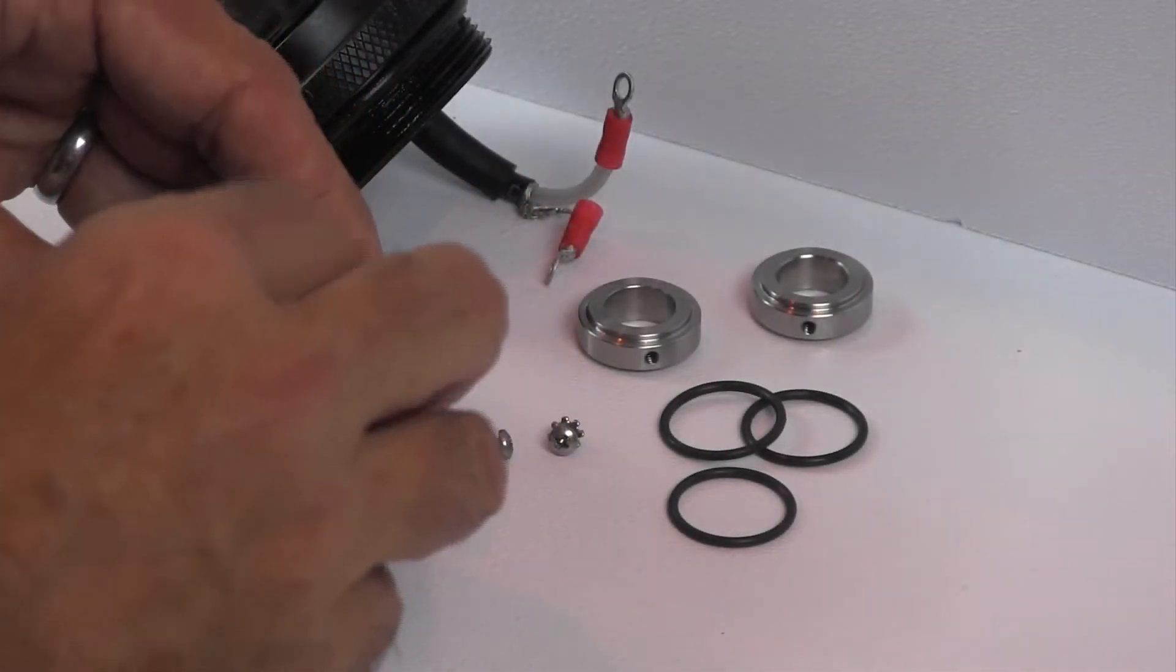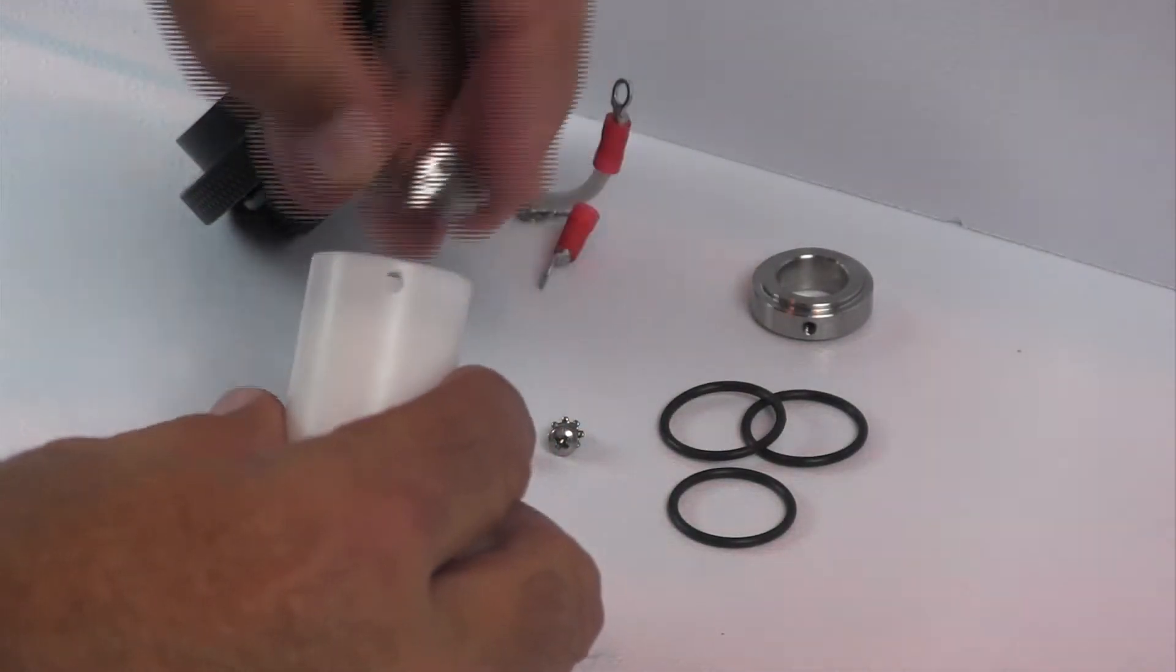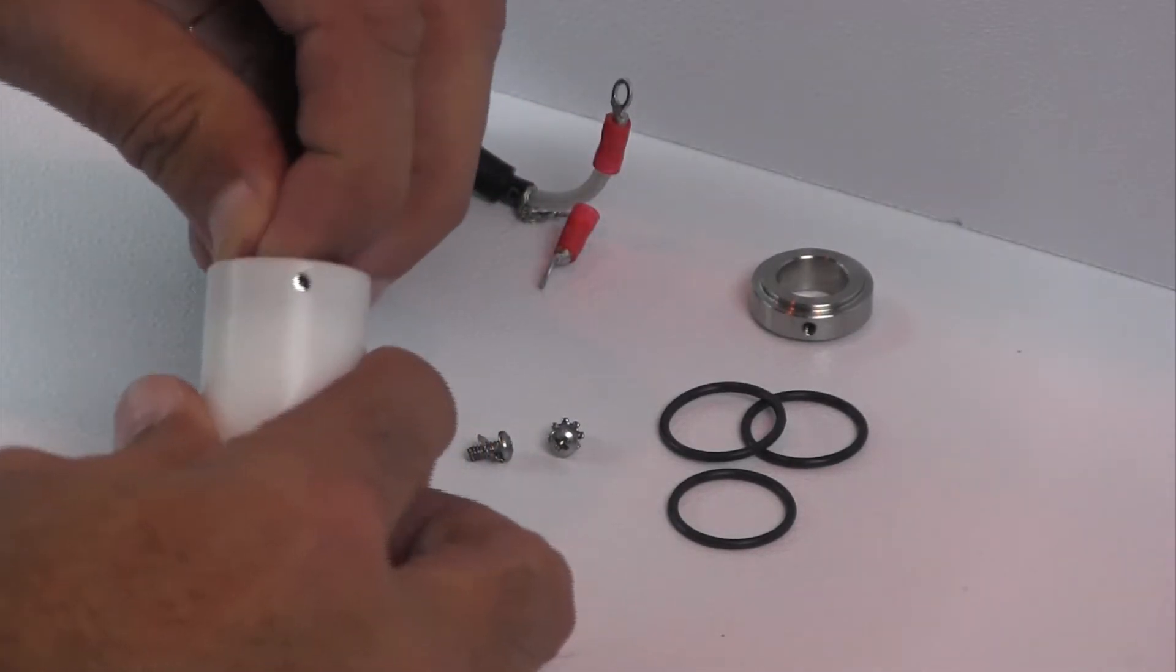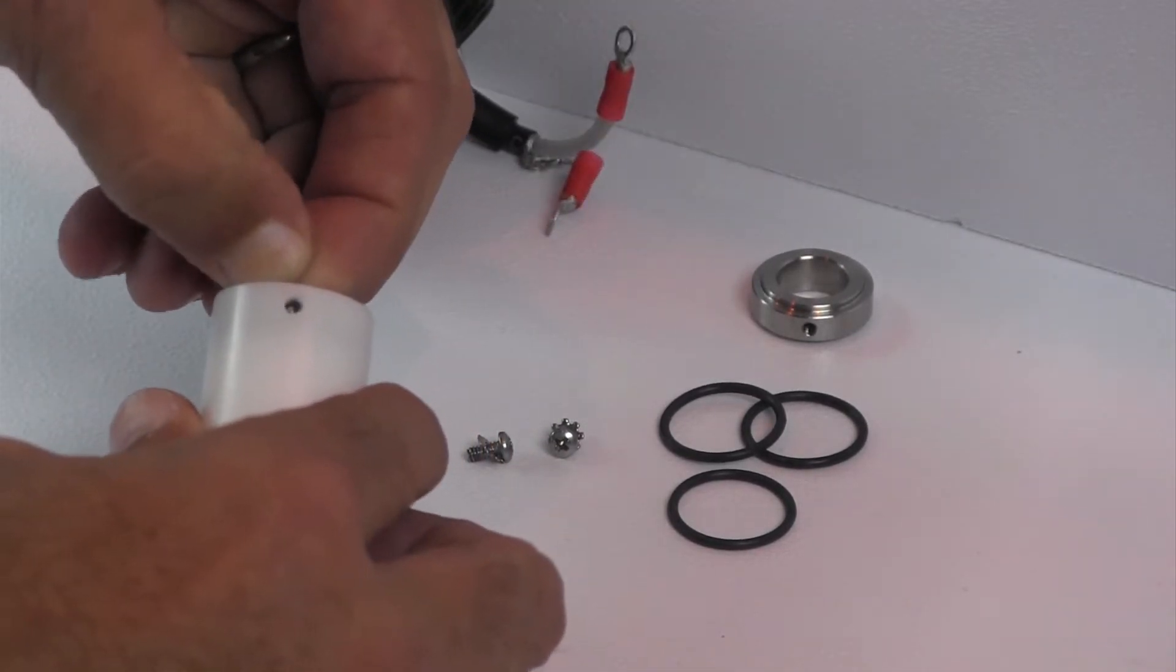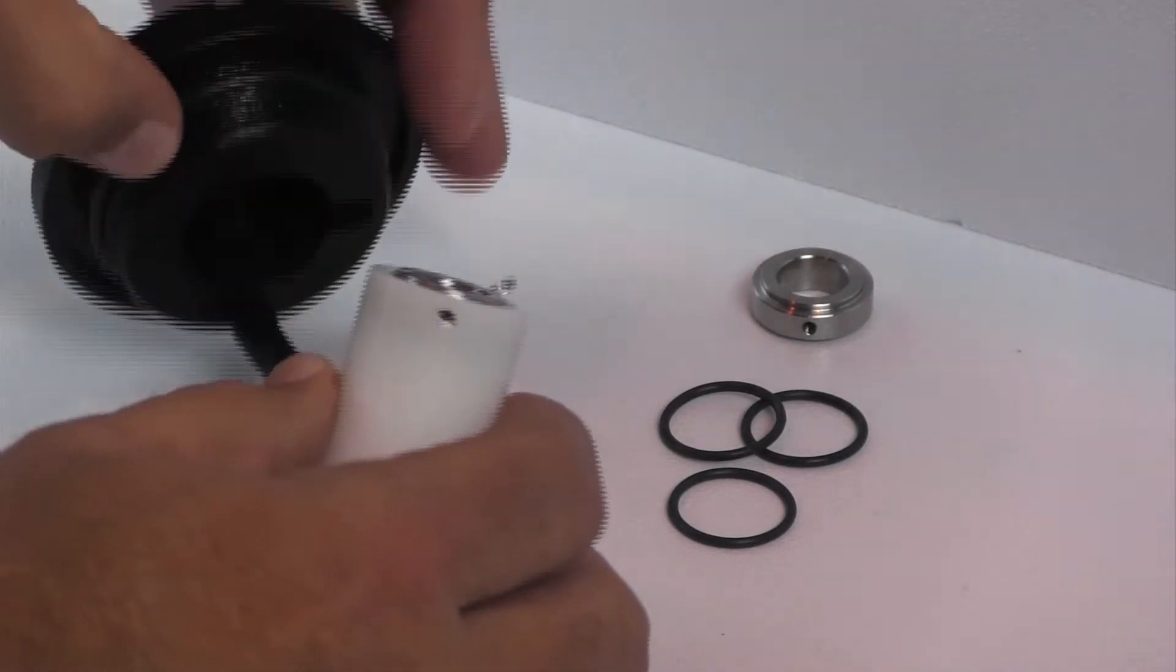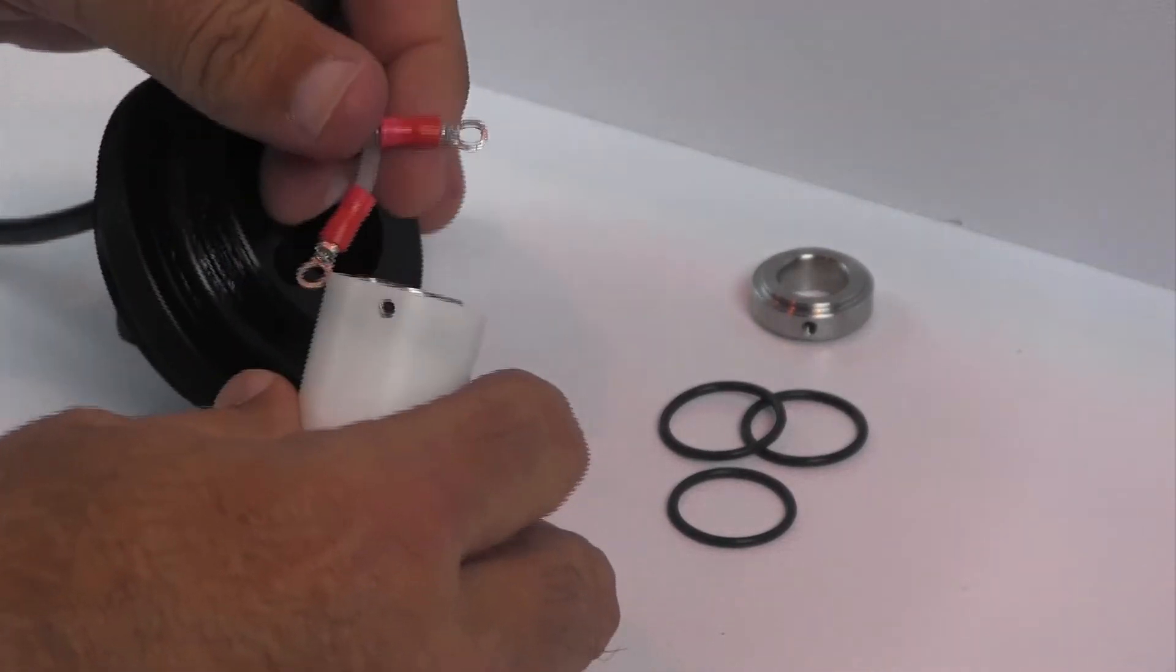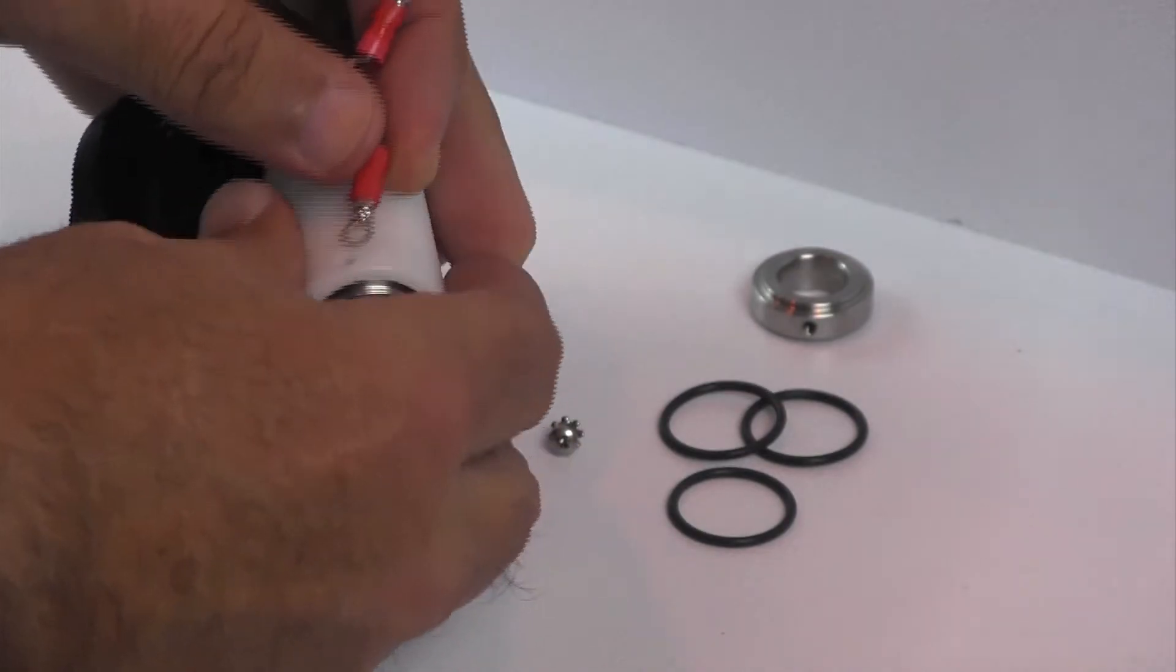Insert one of the four new O-rings into the new sleeve, followed by one of the electrodes, and position it such that the two holes line up. Connect the insulated wire to the electrode.